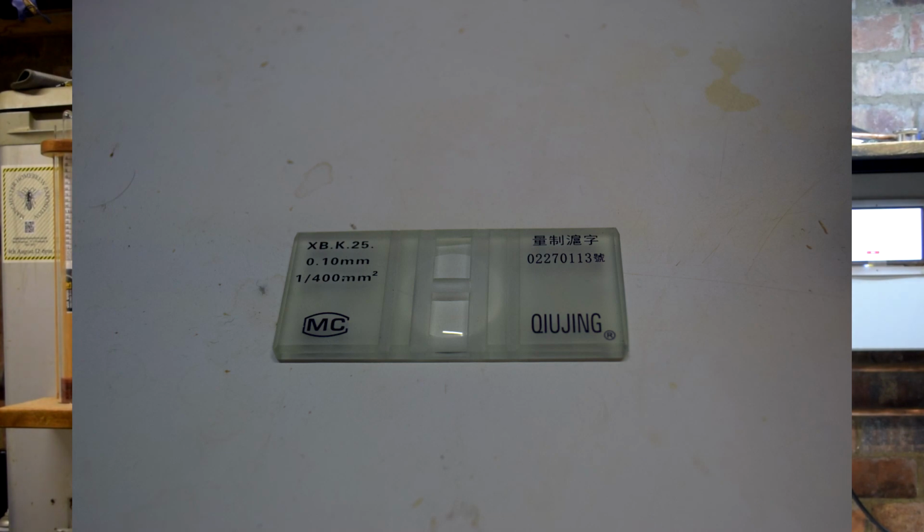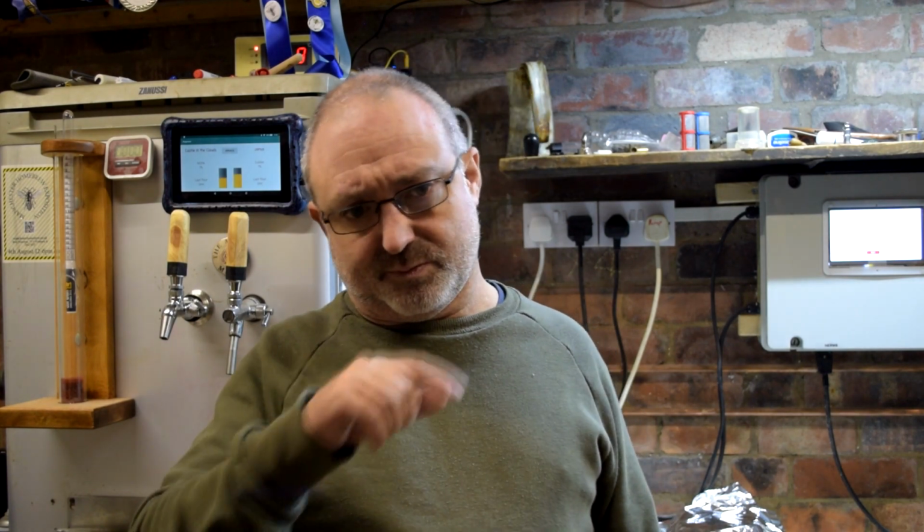A hemocytometer is set up for counting cells of lots of different sizes. So there are a number of grids on this, of little squares for different sizes of cells. As you can see, the one I'm using is the one with the double borders around it. There's a grid of cells with the double borders around them, and we're going to count cells in the corners and the middle. If there's a good distribution of cells, you don't need to count them all. The little extra guidelines are there just to make it a bit easier to count.